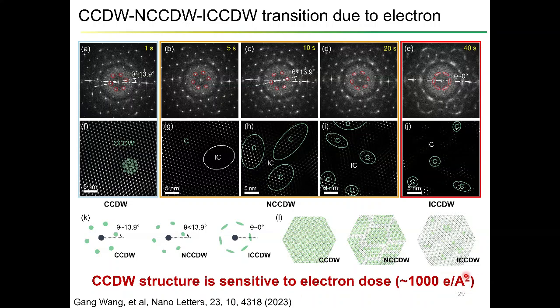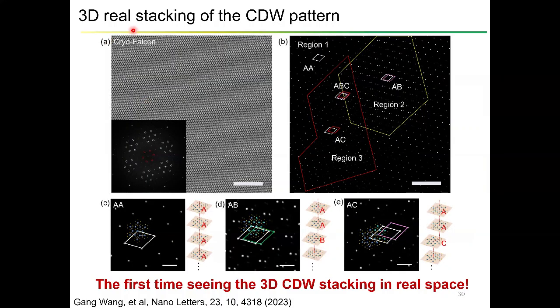And we keep the electron dose below the safe threshold and get a very large image of the real space in the TaS2, so that we can map the real CDW distortion in the real space to see whether there are any unexpected phenomena. And finally, and also luckily, we found that the defect stars also have a stacking fault.